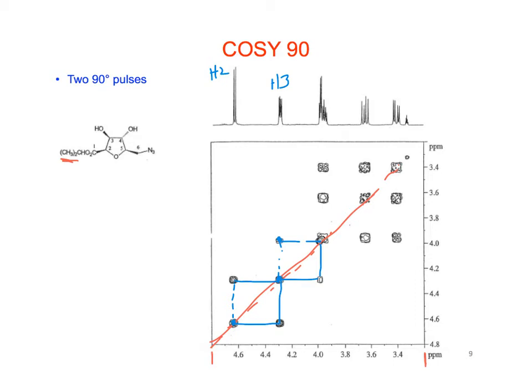Notice when we look at this signal and look either up or down, this signal is only going to half of this. This one is skinny and this one is fat. That tells us that the fat ones are going to one signal here, the skinny one's going to a different signal. So the skinny one here would be going to the skinnier signal right up here.